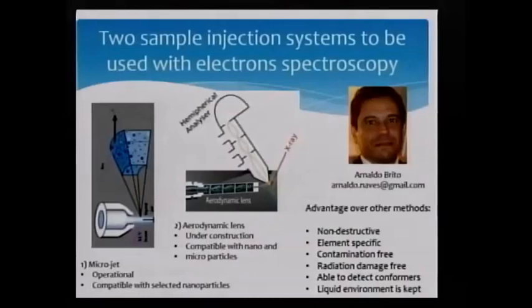Last but not least, this is a very fancy technique, and Arnaldo Brito is developing tools. Actually, this is not a new technique. What Arnaldo does is X-ray photoelectron spectroscopy, XPS. All of you probably know what the technique is, but he's working on different ways of injecting the samples to perform this technique. We generally put the catalyst, dry the catalyst, and then insert it in an ultra high vacuum chamber to measure the spectra.